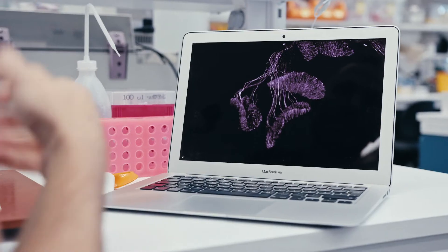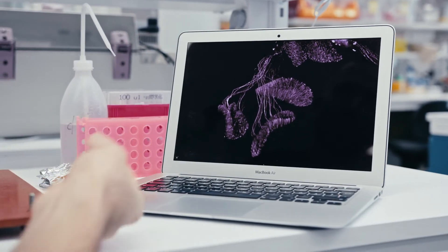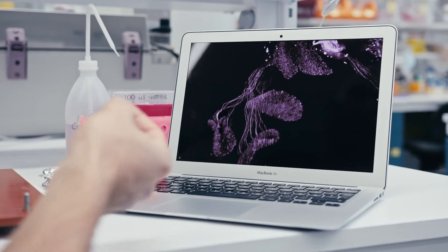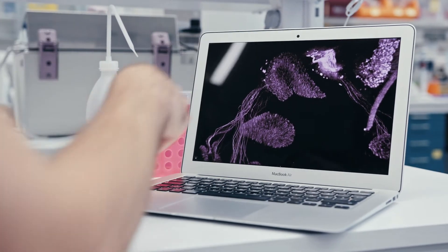And with this technology, it's definitely possible to only target few cells at a time and to follow the projections in every direction here.